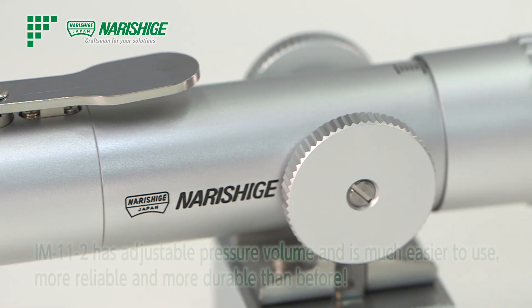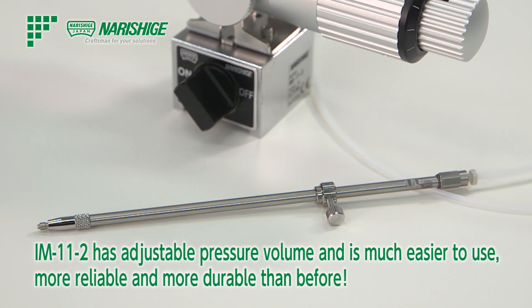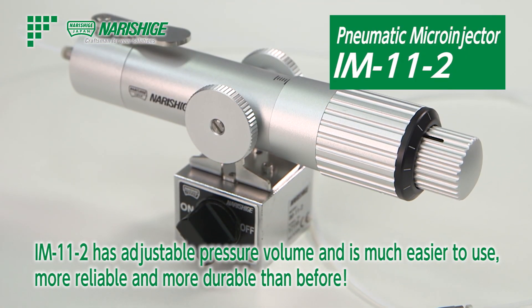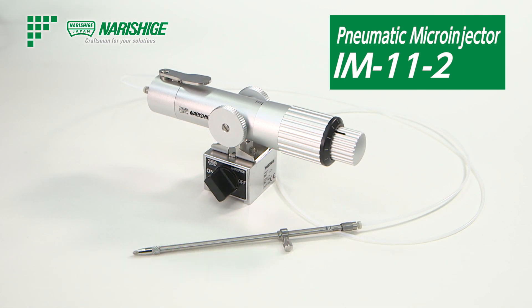The IM-11-2 pneumatic micro-injector is capable of adjusting the pressure value as needed, easy to use, reliable, and virtually maintenance-free. This completes the introduction of the IM-11-2 pneumatic micro-injector. If you have any questions, please feel free to contact Narishige representatives.